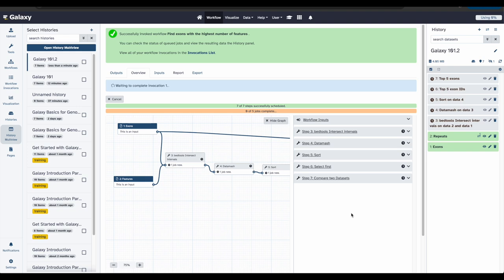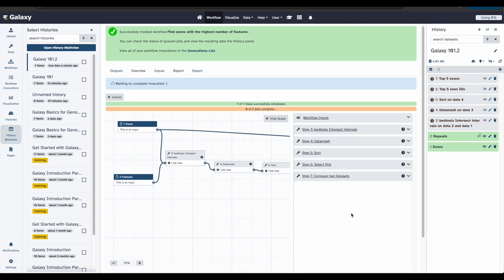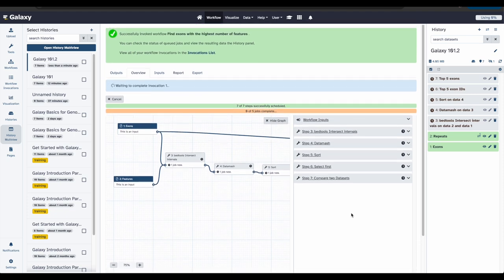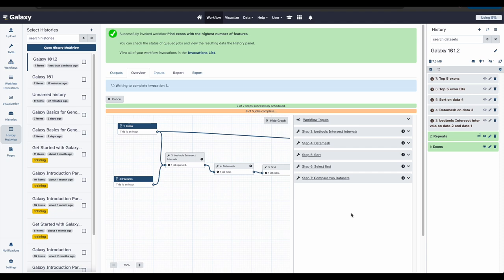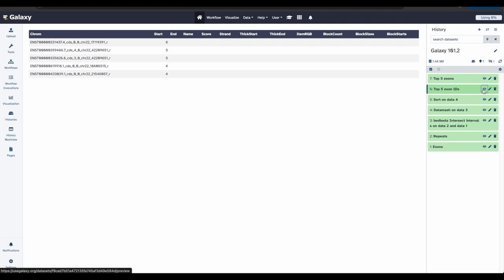Now you can see that Galaxy is running your workflow on the new data. All the steps that we just took in the previous section and all those tools we ran in the first part of the tutorial are now automatically running on the new data. Once the workflow has finished running, you will be able to view and examine the data analysis. Now that the workflow is finished running, feel free to check out the results and see what we found.